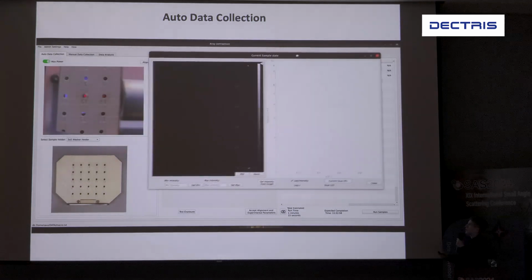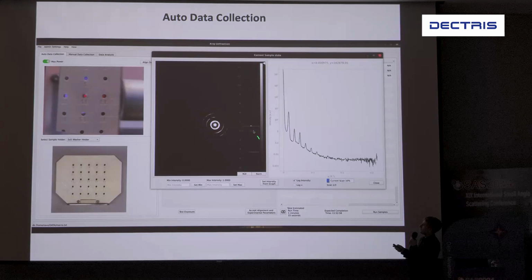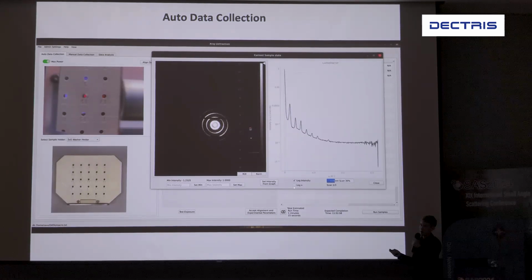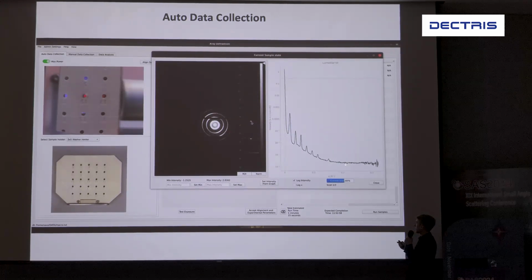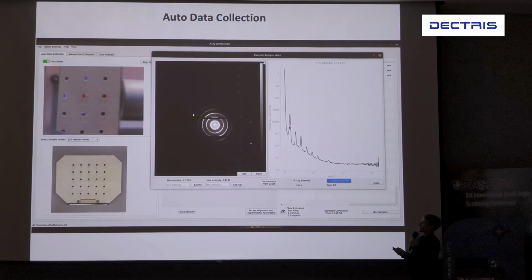But anyways, you can see right here that basically all you do is you click and run, it moves to the sample, aligns itself, and then this is a live imaging process of basically, here's the data in real time, refreshing 10 times a second, and then here's the integrated data. Some nice features about the detector is that it can take the direct beam. Because it has the ability to take the direct beam, I'm able to auto-align the system and also be able to do this data reduction very quickly.